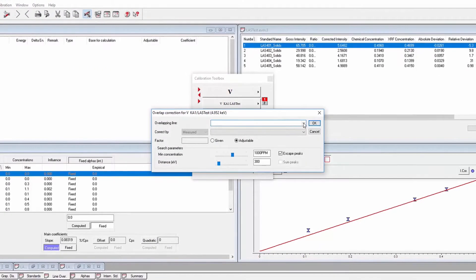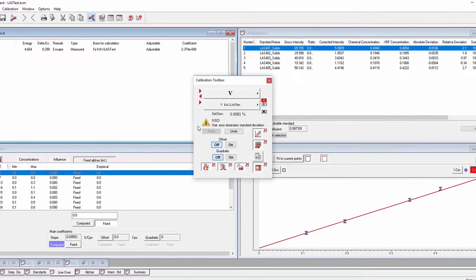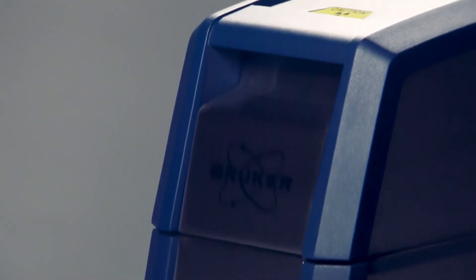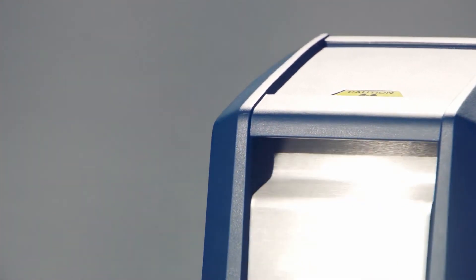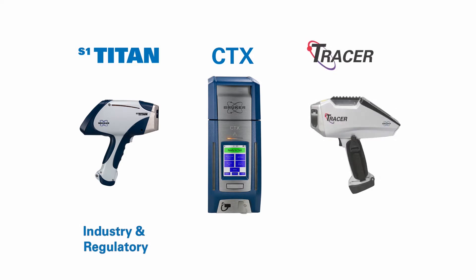The instructional wizard walks the user through EasyCal's calibration process using a graphical interface. The portable countertop CTX is the newest member of Bruker's handheld mobile portable XRF family, joining the handheld S1 Titan introduced in 2012 for industrial and regulatory applications, and the handheld Tracer 5i introduced in 2016 for academic and industrial research applications.